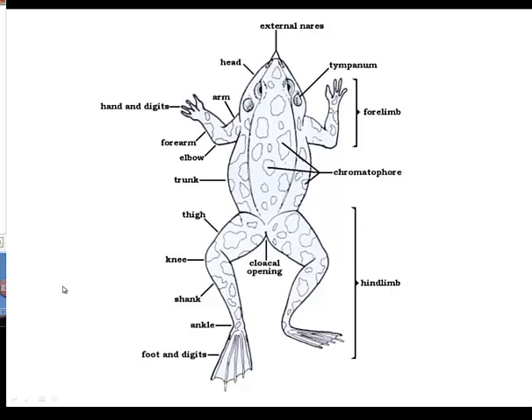When we talk about the limbs, we're going to talk about forelimbs and hindlimbs — the legs and the arms — so refer to them as forelimbs and hindlimbs. One of the things to notice is that you still have your cloaca, your cloacal opening. When we're doing our dissections, we're going to spend the majority of the time in the trunk area, and as far as external anatomy, we're going to focus mainly on the cranial region.